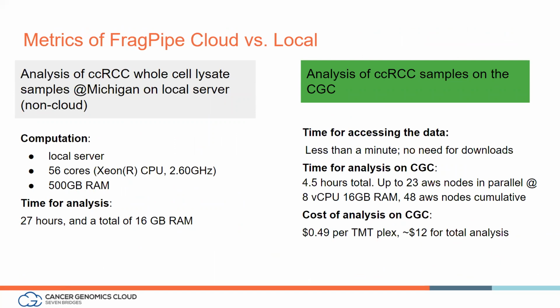So we have approximately 500 samples that we need to search, validate, quantify, and filter. That's a pretty considerable amount of data.